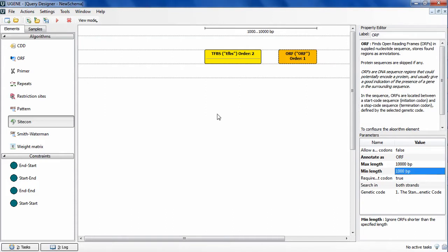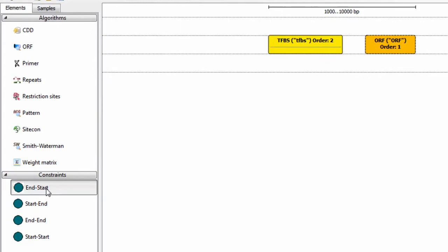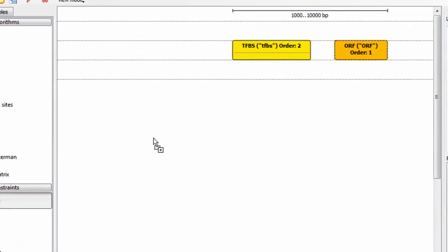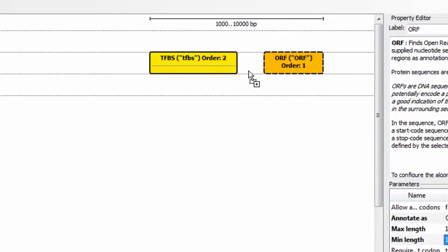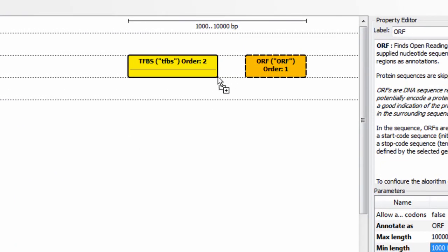Now I need to specify that the distance between every found ORF region and TFBS region must not exceed 150 base pairs. To do so, I click on the End Start Constraint element and drag it onto the schema, placing it in between the TFBS element and the ORF element.